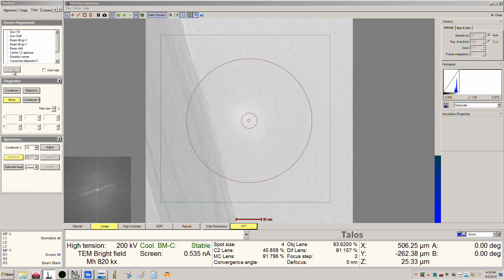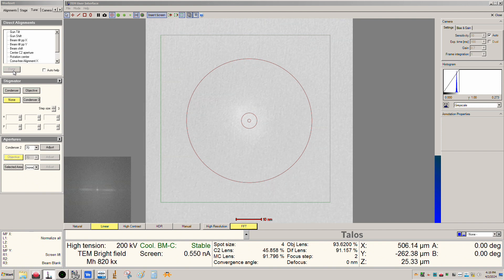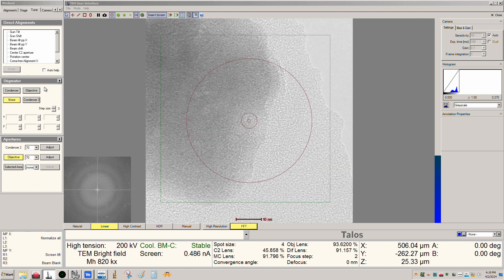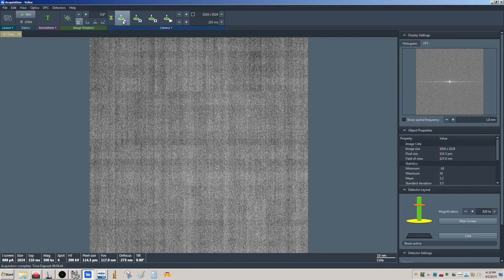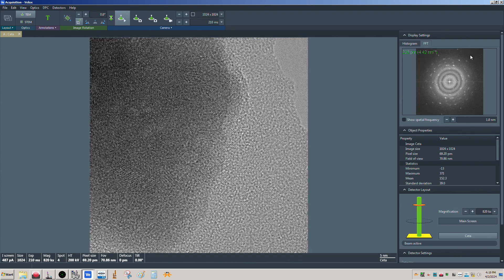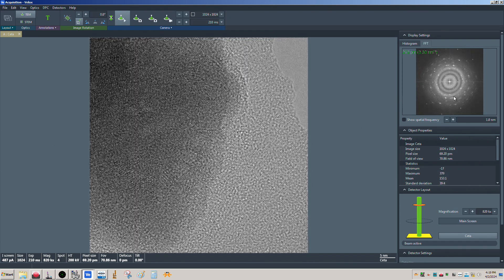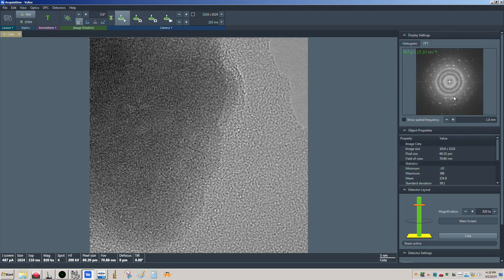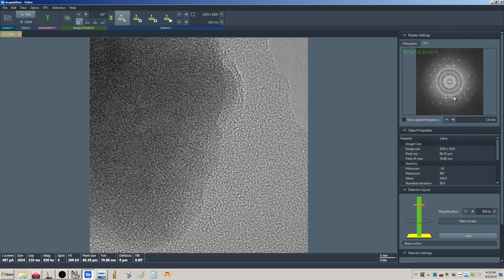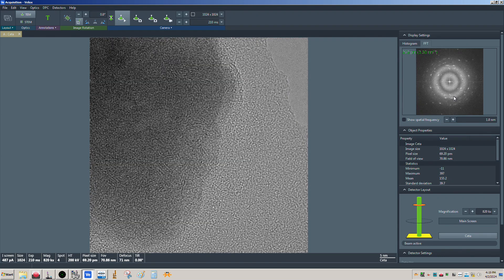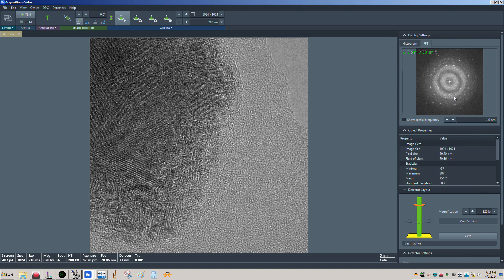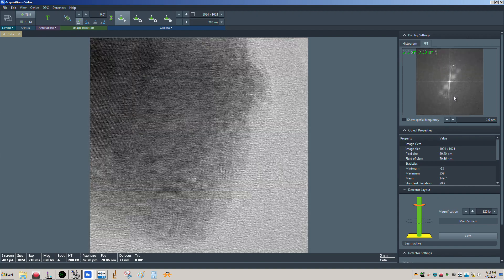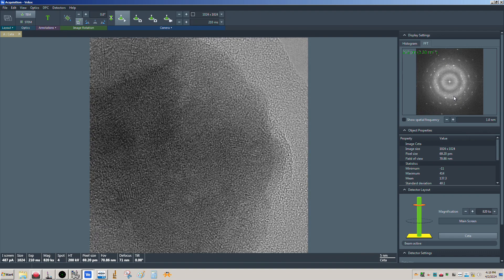Let's find the particle again. Going back to acquisition mode and starting the view. We can see there's still a little bit of astigmatism, so we'll go ahead and fix that. There we go — you can really see the lattice detail in the particle now, really quite well.